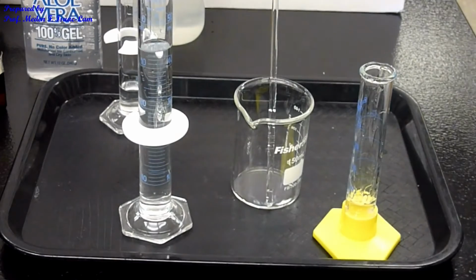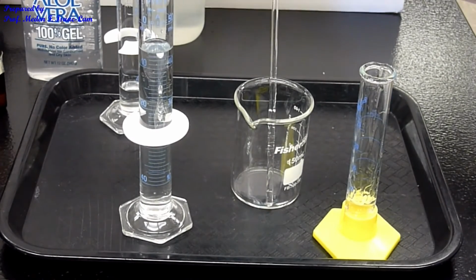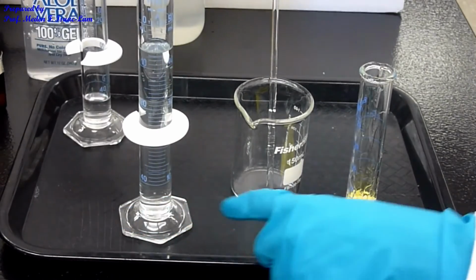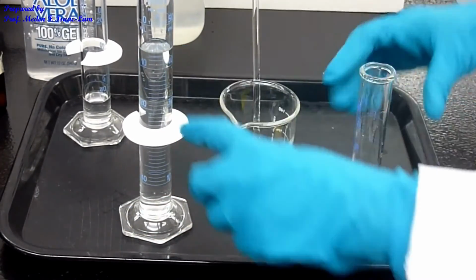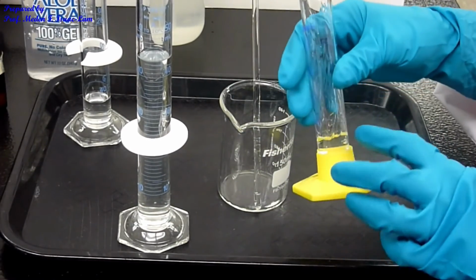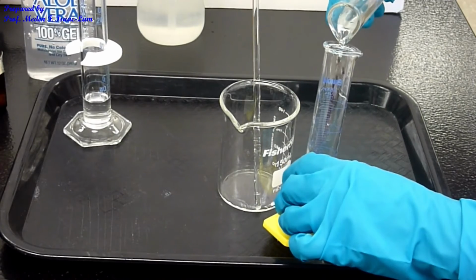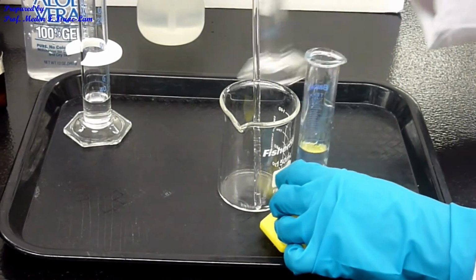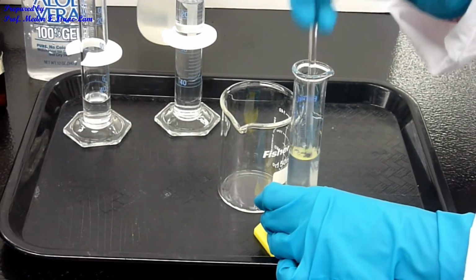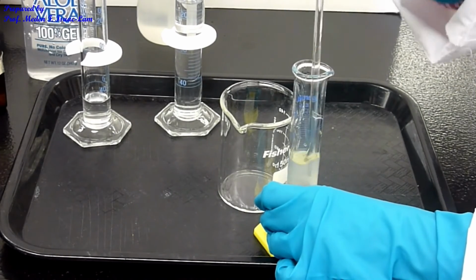I measured 43.0 ml of the ethanol solution that we made from part A. The remainder, 7 ml, is still here. Now I'm going to mix this together, this 43 ml and then 7 ml of the aloe vera gel. So I simply put this here so that I can take out the gel, and then I will try to dissolve it. It takes a while to dissolve, but it will dissolve.